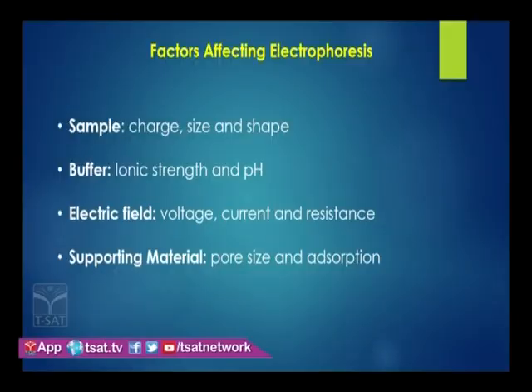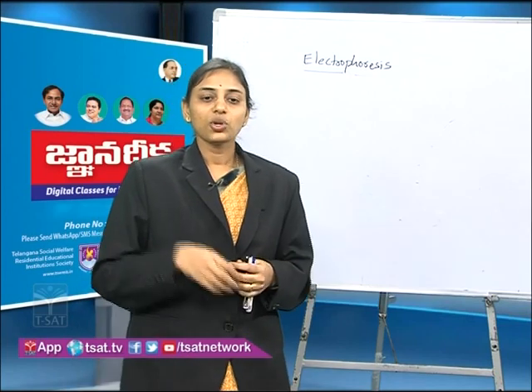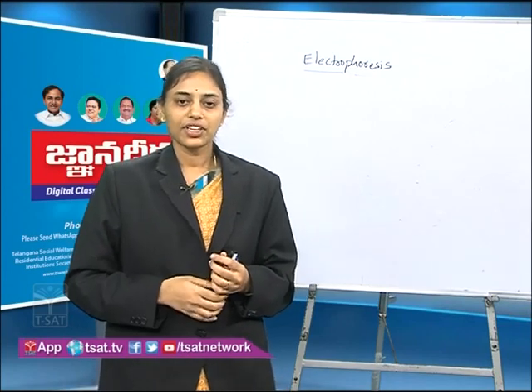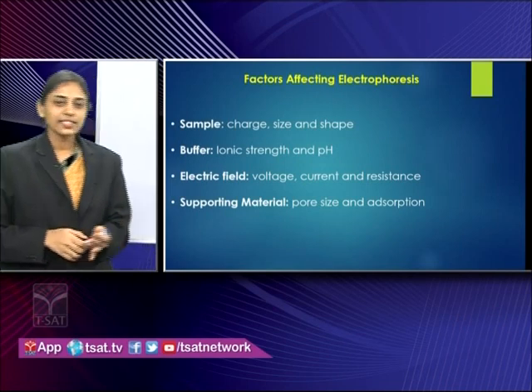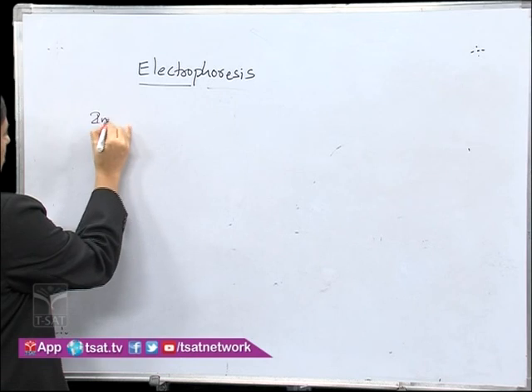Next, we will see factors affecting electrophoresis. Both intrinsic and extrinsic factors affect the process of electrophoresis. Sample properties come under intrinsic factors.